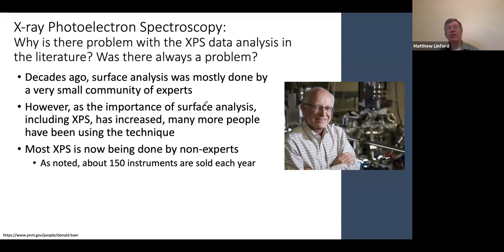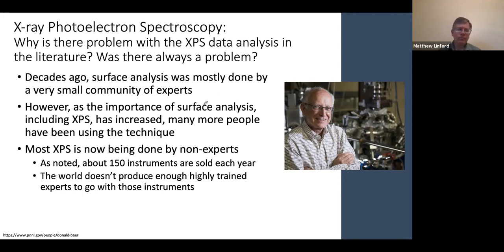And in fact, the tables have flipped. I think about 95% of what's in the literature is XPS that's shown by people that are not part of surface analysis groups. Unfortunately, it looks like the world is not producing enough highly trained experts to go with those 150 instruments that are being sold each year. They're put at a university, and people can just go up and use them and get the data. And then again, very often the data are misinterpreted.